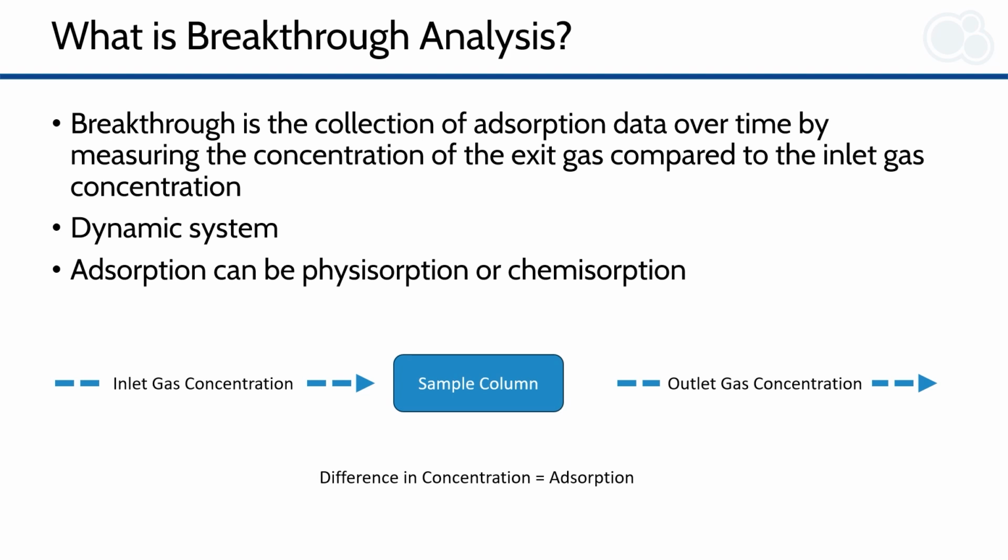Additionally, adsorption can be physisorption or chemisorption, so there's not necessarily a distinction like there is in some other techniques. Breakthrough can consist of either physisorption or chemisorption processes for the actual adsorption.